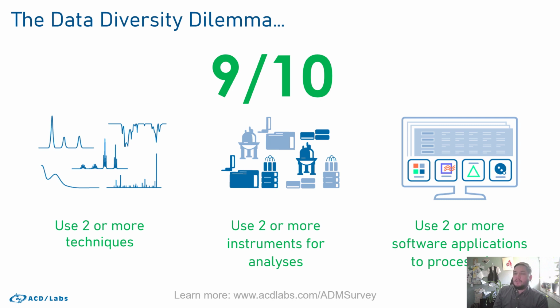So this is the sort of issue that is not a quote unquote problem that needs to be solved. It's not like we need to be doing less checking of our work by comparing the NMR and the mass spec, or the NMR and the chromatography. Rather, we need to think about solutions that allow us to use these different kinds of data more holistically and with fewer barriers between them.